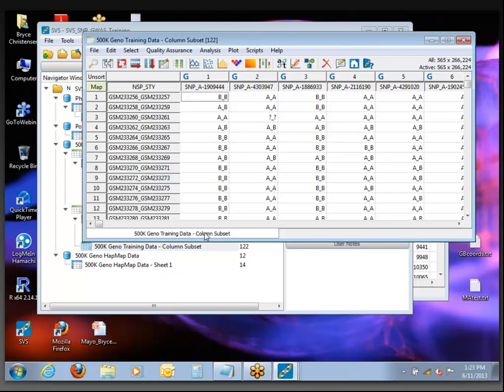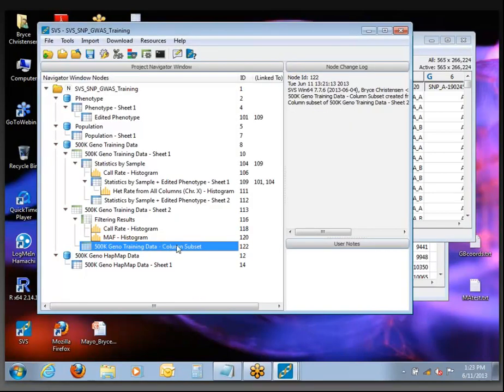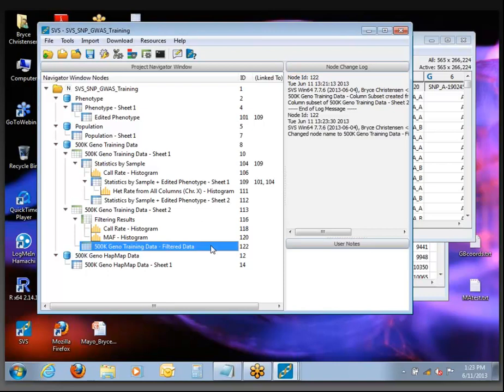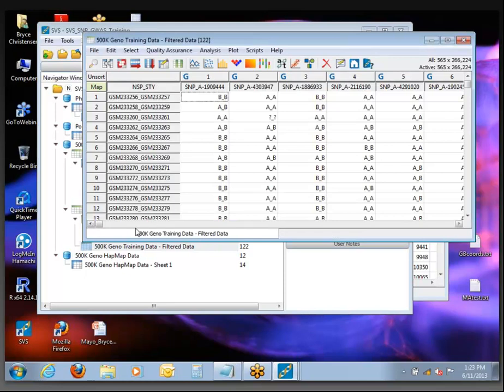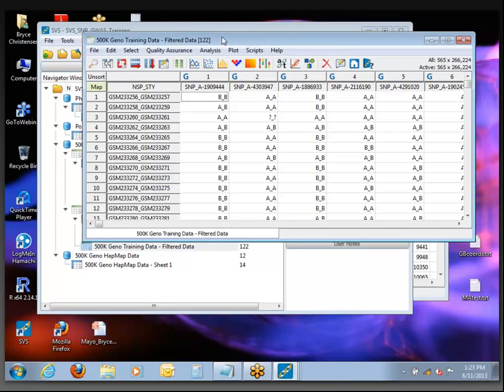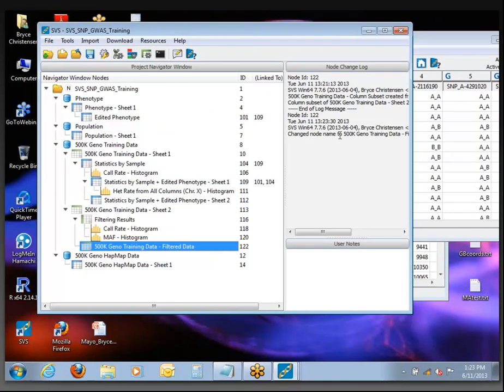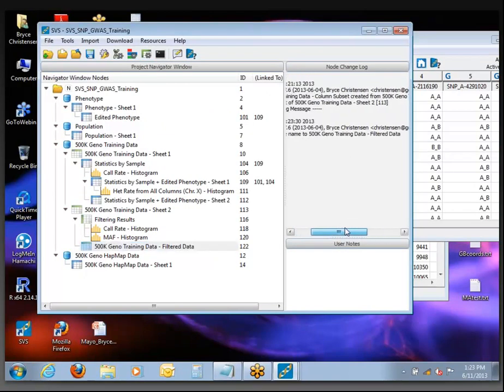Before we go further, we are going to rename this. By default when you create a column subset, it just labels it 'column subset'. You can come right here in the project and do a slow double-click on it, just like renaming a file in Windows, and change the name — I'll just call it 'filtered data'. Also, when you have the spreadsheet open, you can right-click the tab at the bottom and change it there too. Either way, it will be reflected back in the project navigator.